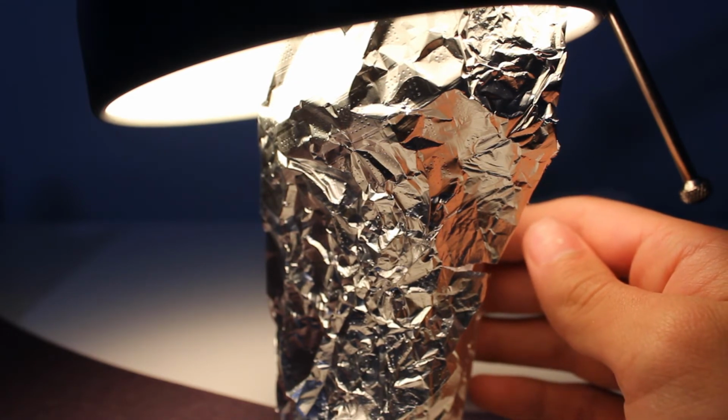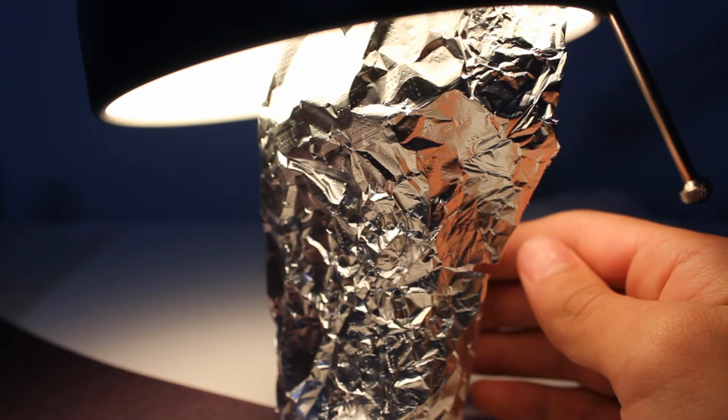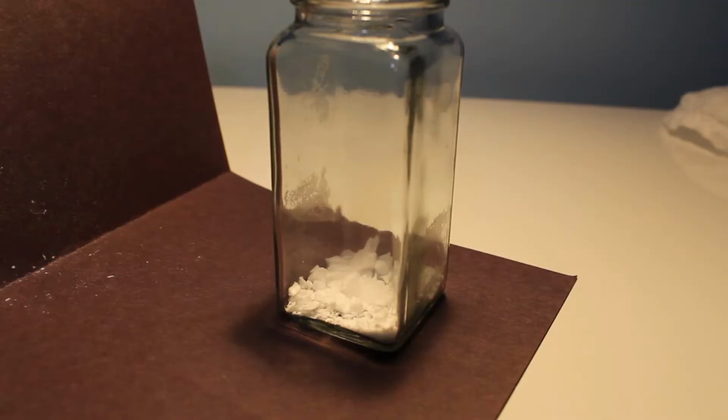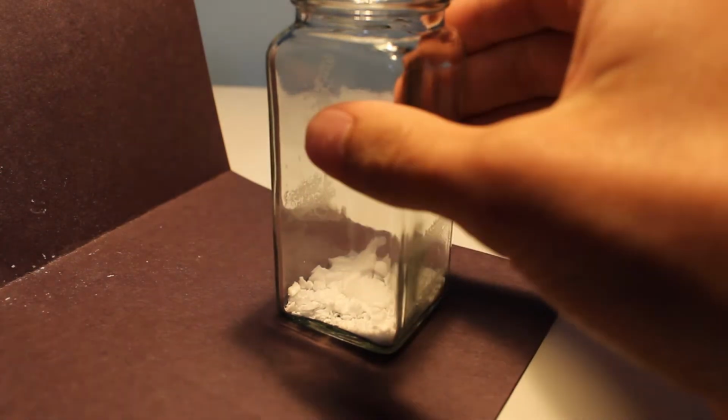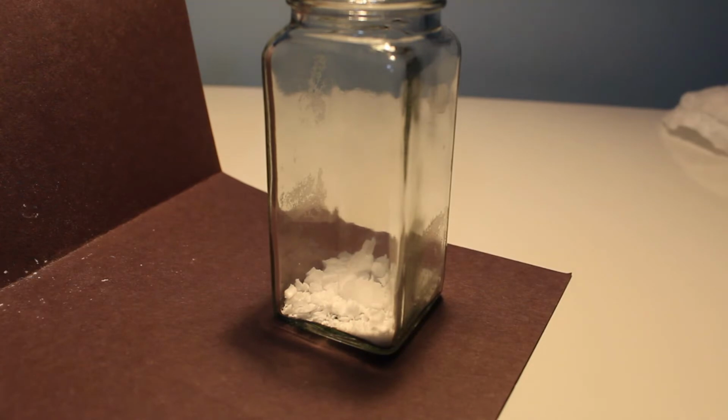If not, I'll just have to leave it out somewhere, probably with light, so that it can dry out more quickly. This might not look very impressive, but I heated this to the point where it almost burns me when I touch it, so I can't pick it up. And so I think it's hot enough to drive off the water. Probably all of it. I'll check in later.